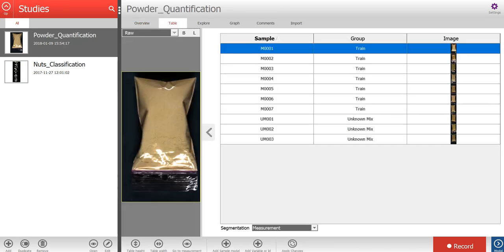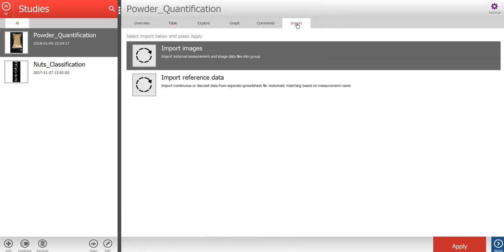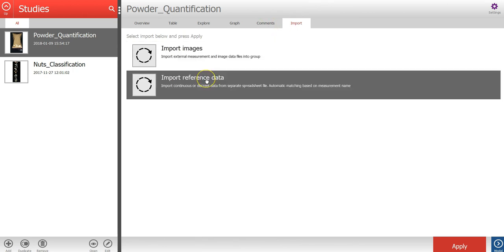Now let's import the reference values for the training samples. If you press the import tab, you can then select import reference data.